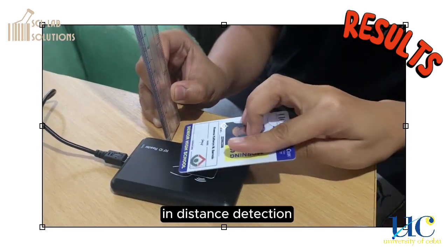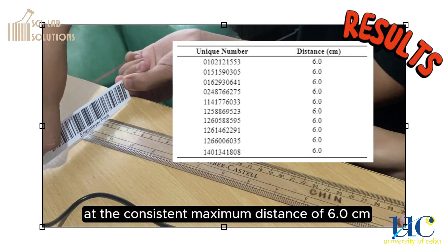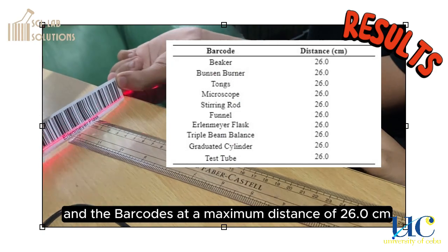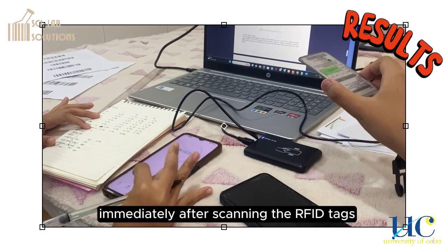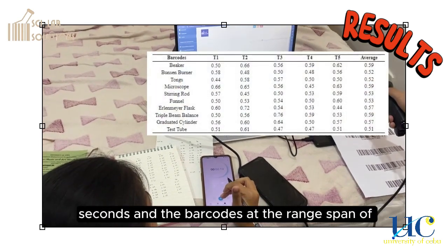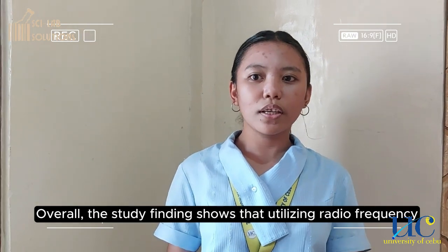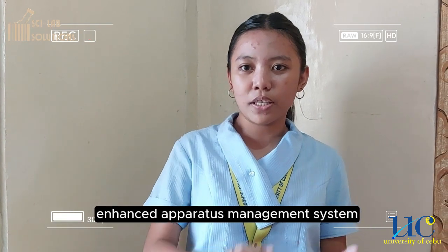In distance detection, the Scilab solution system can detect the RFID tags at a consistent maximum distance of 6.0 cm and the barcodes at a maximum distance of 26.0 cm. In response time, the Scilab solution system is able to respond immediately after scanning the RFID tags in a range span of 0.49 to 0.60 seconds and the barcodes in a range span of 0.50 to 0.60 seconds. Overall, the study findings show that utilizing radio frequency identification and barcode is an efficient and enhanced apparatus management system.